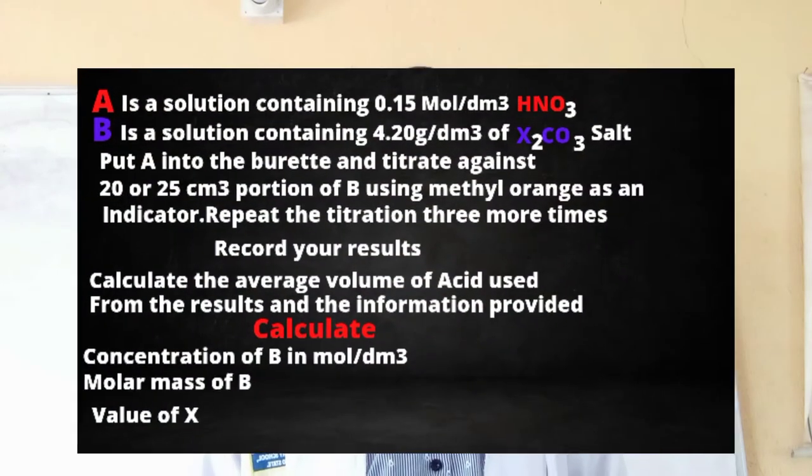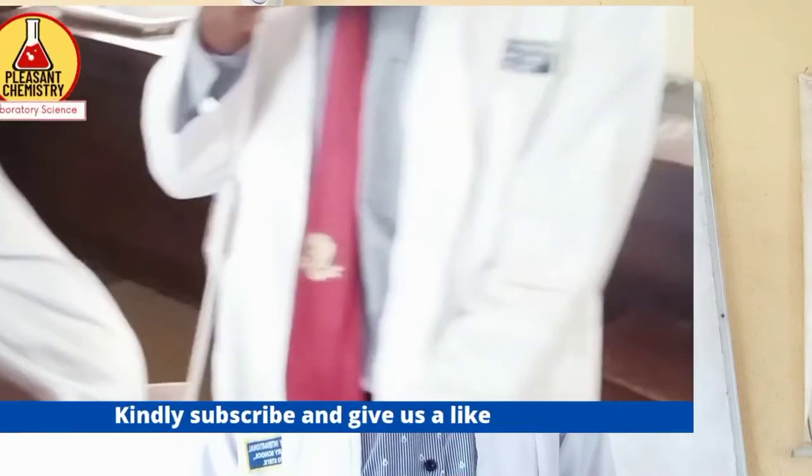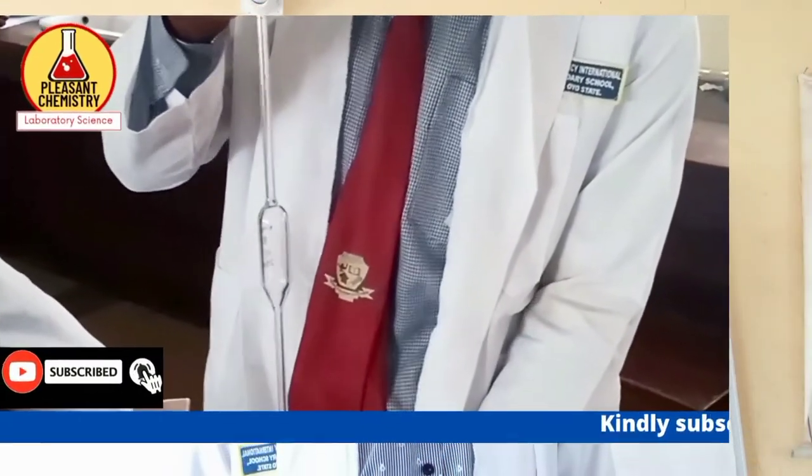In this video, I'll be treating this year's NECO practical with its marking guide, and I'll also be displaying the practical procedure. The question will be displayed on the screen.